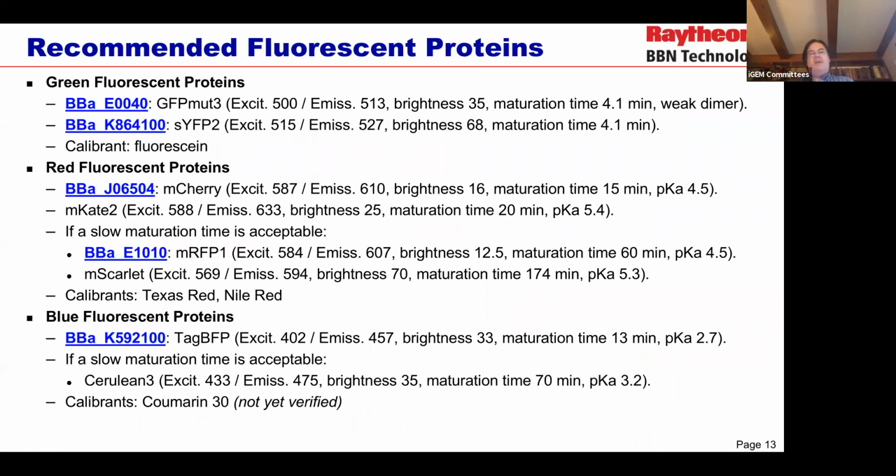I'll end by just taking a recommendation. I'm not going to go through all the detail here, but the measurement committee has recommended a set of standard fluorescent proteins and calibrant dyes that we can use with each of them.